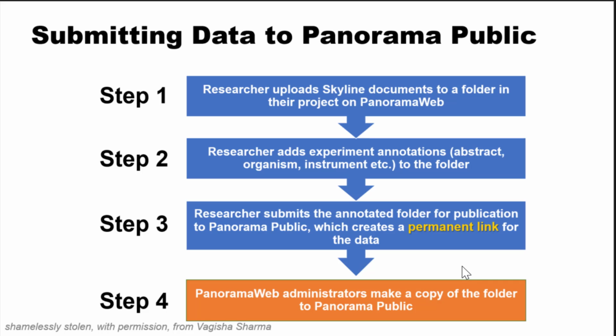I have just a more general question. Suppose we wanted to data mine the entirety of it. How well does PanoramaWeb support that? So Panorama is mostly targeted experiments. As far as data mining, the computational lab that I'm a member of mostly uses Massive and Pride repositories for doing data mining. It's a lot of DDA experiments in there. Raw files for targeted experiments are maybe not fantastic for data mining.